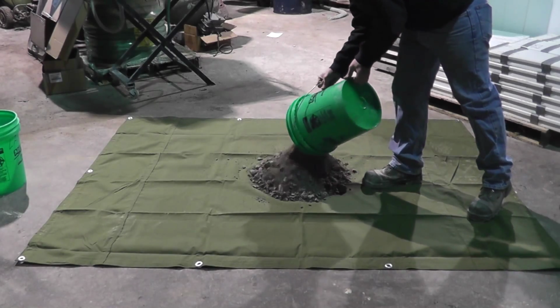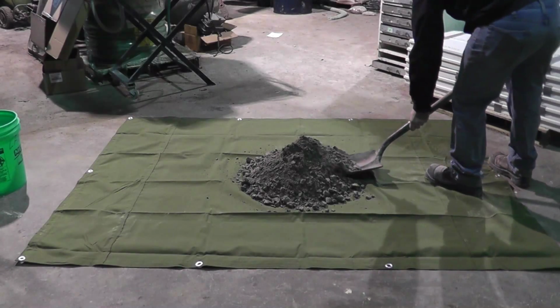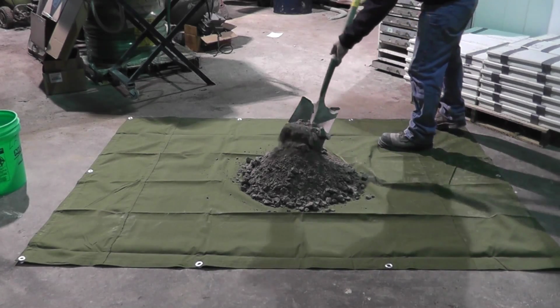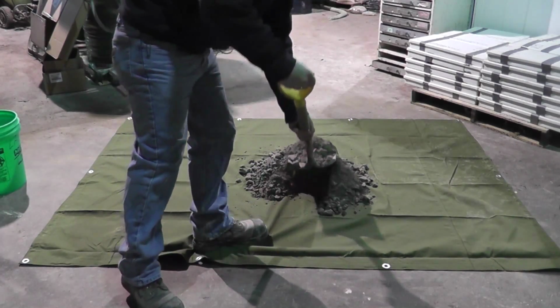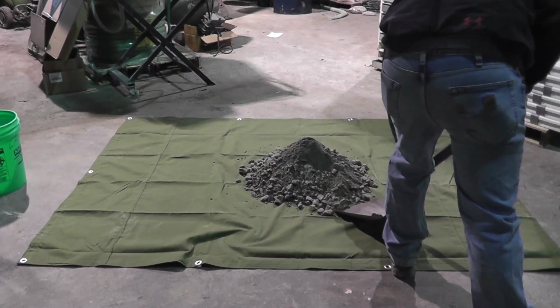Place the original sample on a hard, clean, level surface. Mix the material thoroughly by turning the entire sample over with the shovel at least 3 times. With the last turning, shovel the entire sample into a conical pile by depositing each shovelful on top of the preceding one.